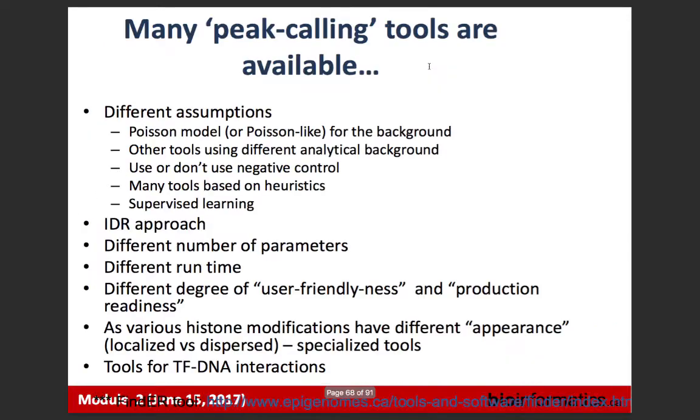Maybe I skip this. I just wanted to mention that in terms of peak calling tools, there are very, very many. People are trying to use different tools, and it's still, in our view, somewhat open area, although many tools are published. Tools published on different principles, just to give you an idea, they're different. So some tools have explicit assumption about the analytical form of the background.